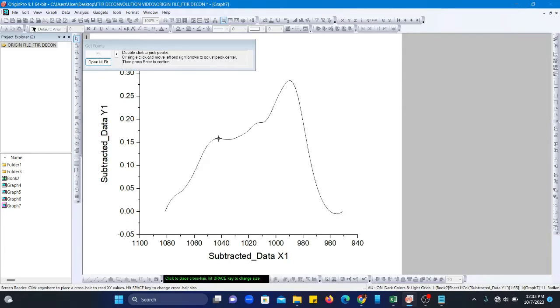As I am doing the deconvolution for the starch process, those are related to the hydrated, crystalline or amorphous structure of the starch. Whatever peaks will be revealed in this particular deconvolution process, there would be certain significance associated with those peaks.